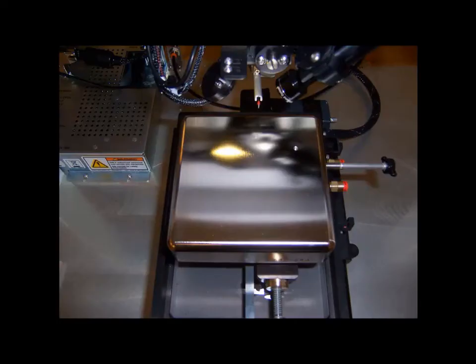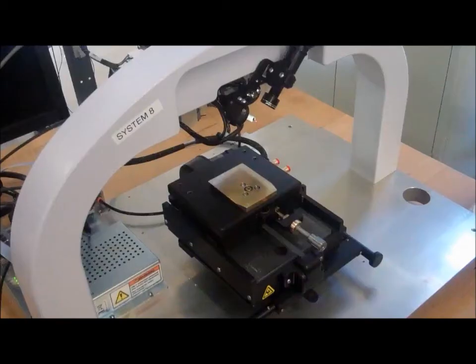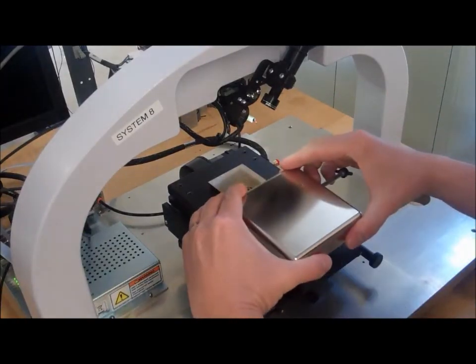The sample block is 100 mm square and is easily installed on the DECTAC XT with a dovetail adapter plate.